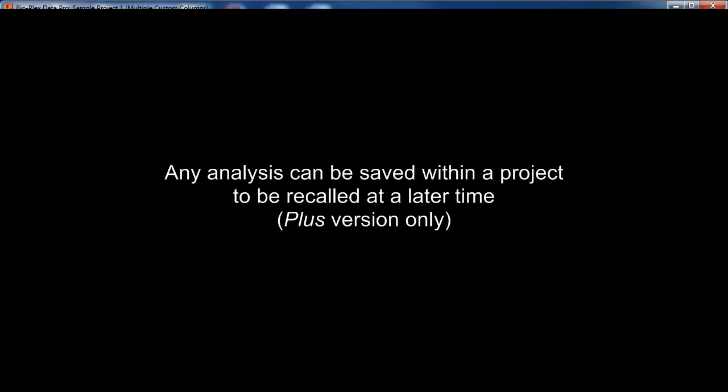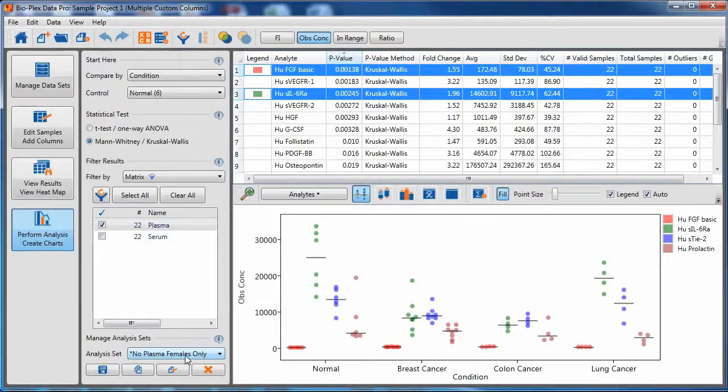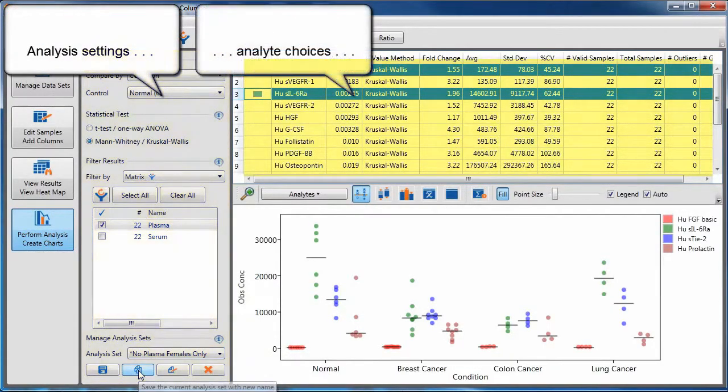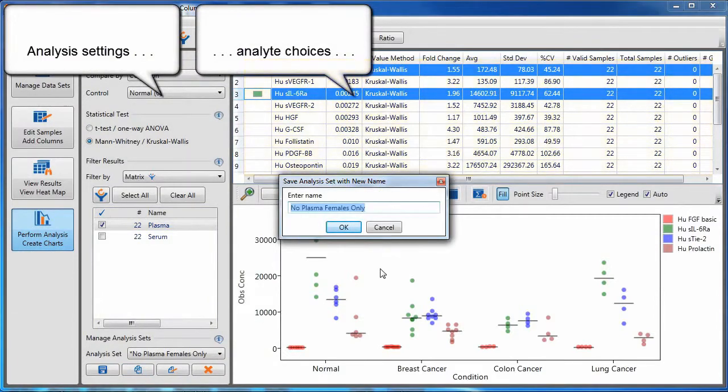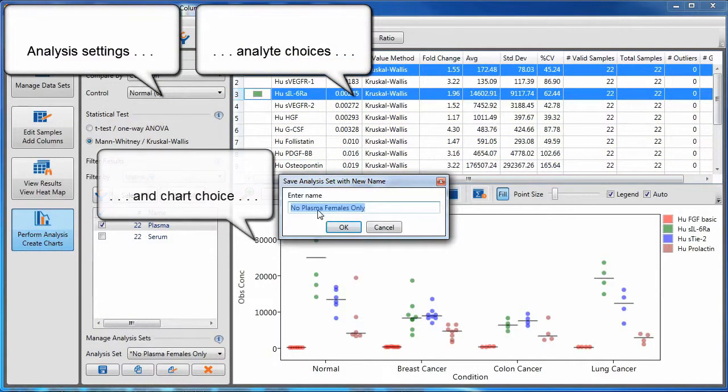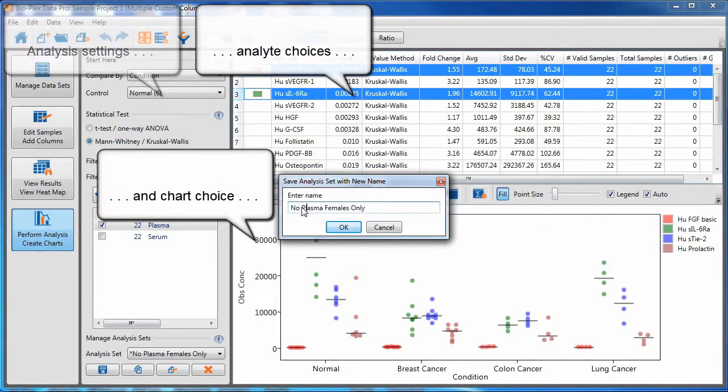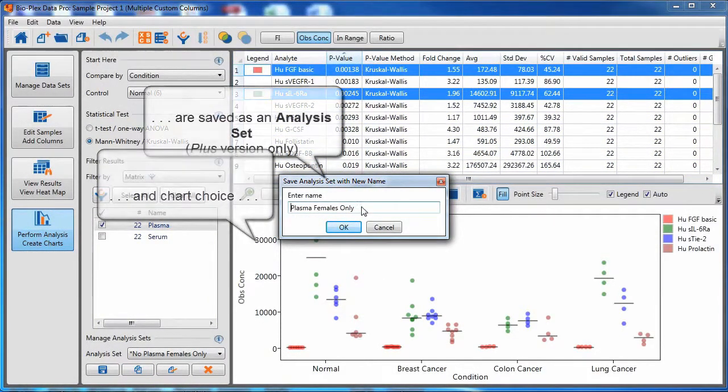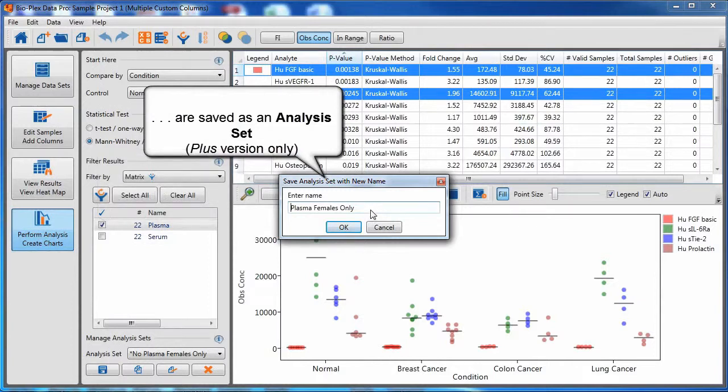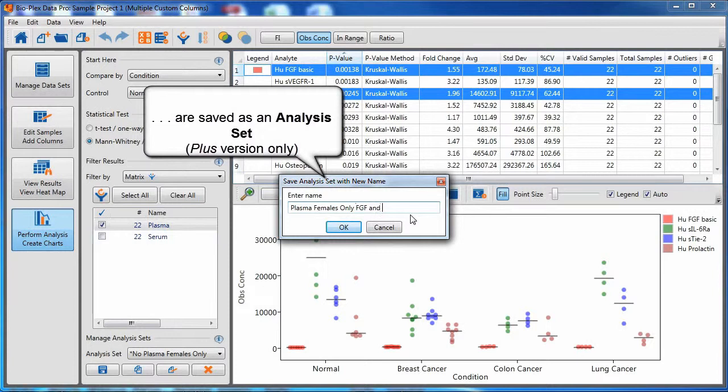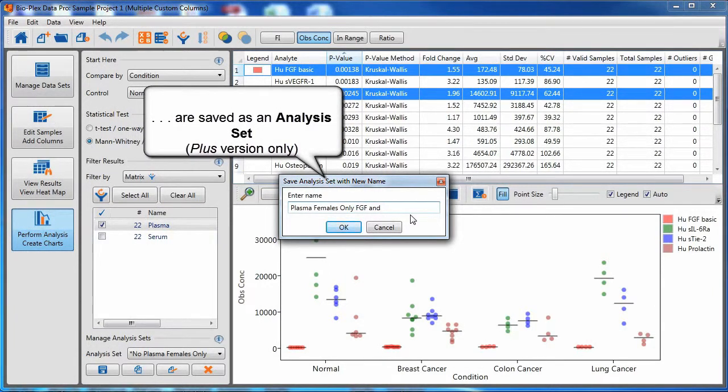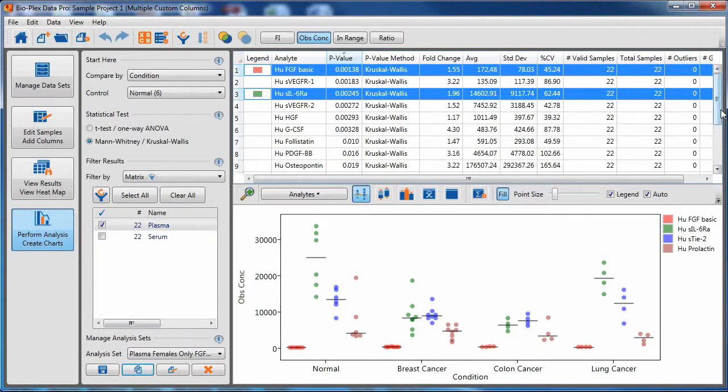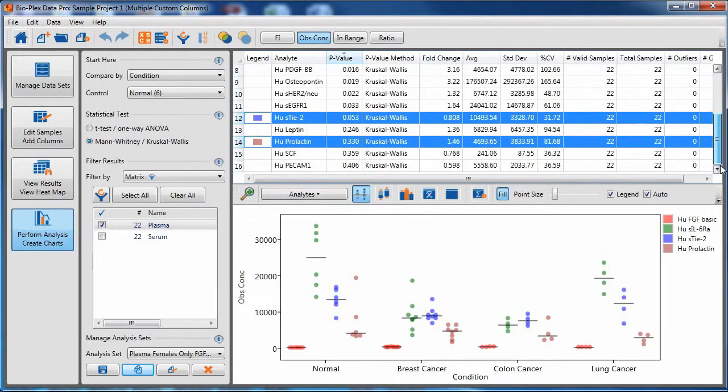Any analysis can be saved with any project to be recalled at a later time. This is available in the Plus version only. Analysis settings, analyte choices, and chart choice can be saved as an analysis set. In this case, I have changed my analysis settings and I am naming a new analysis set. Once saved, that analysis set is available in the pull-down menu on the lower left.